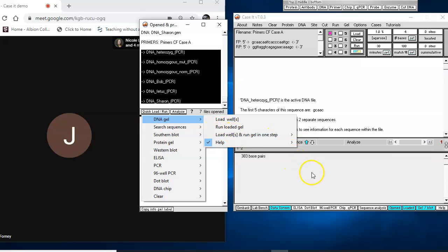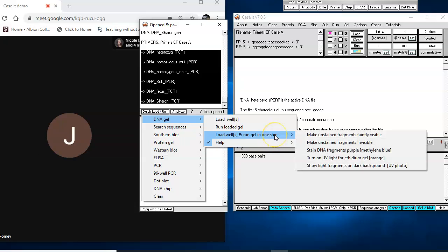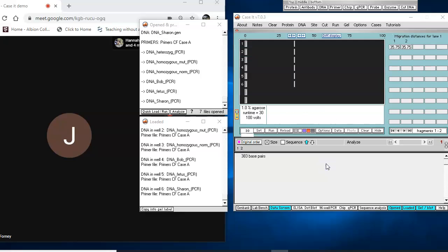So what's it going to look like if I run a gel? There can be any differences. They can be all the same. Let's find out. They're all the same because all we did so far is PCR. So the PCR products will always be the same. And then we would have to digest those with restriction digest and then run them on a gel, and we'd have our 3 controls and our 3 patients. And then you can just compare the patients to the controls and tell what their genotypes are.